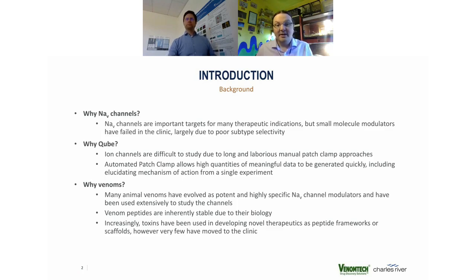Yeah, thanks, Juha. Obviously, forming a company called Venomtech, it's obvious that we have an interest in venoms. And it's nice that Kim has just recently presented some of the knottins and how they interact with sodium channels. But the reason to look into venoms for ion channels is that they are a very good mechanism for interacting with your prey or predators, and evolution has honed this over millions of years.